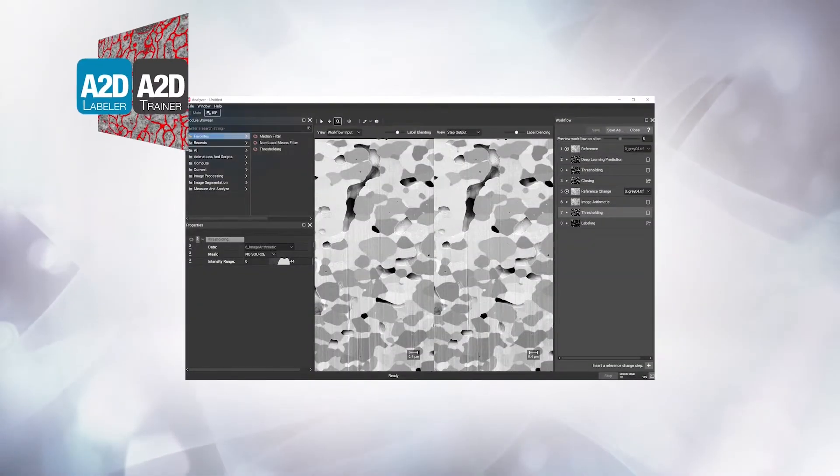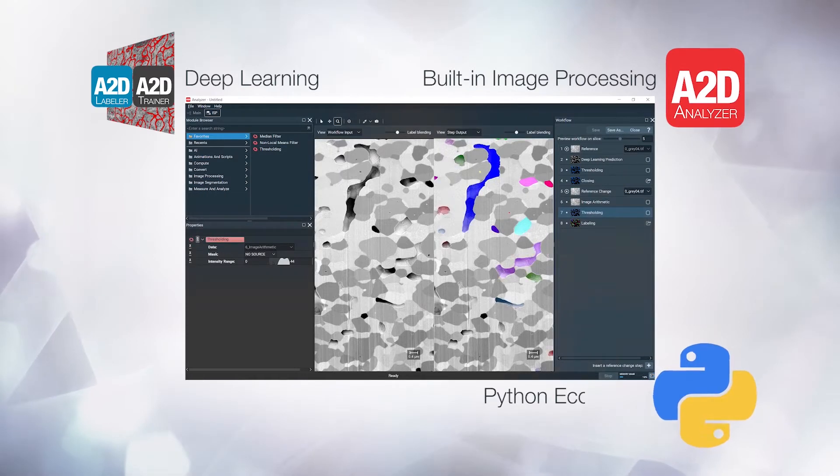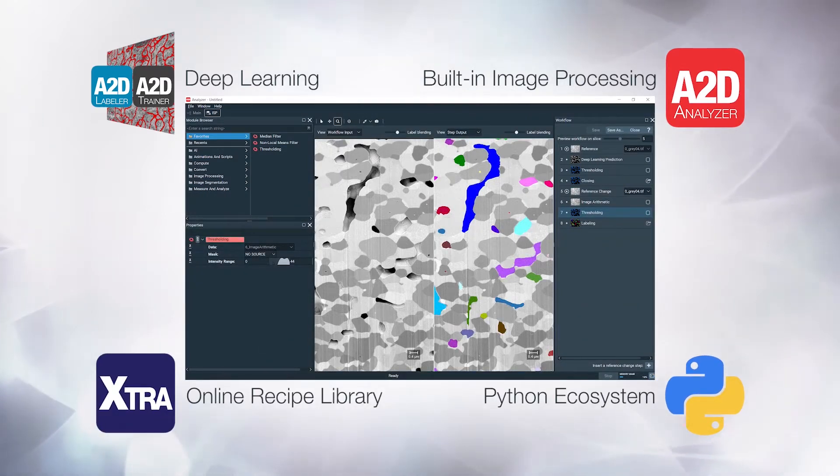Download a free trial version of Aviso2D software and see how it allows you to easily extract quantitative information from your imaging data.